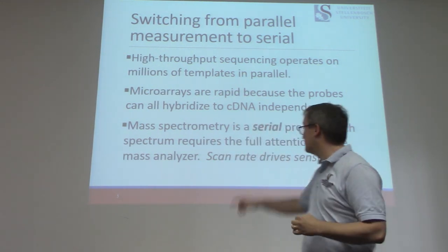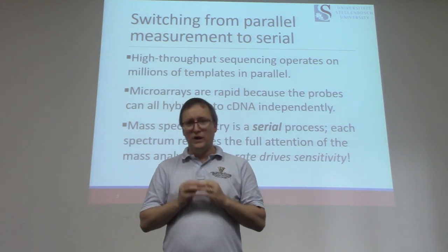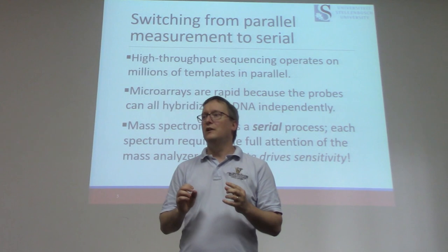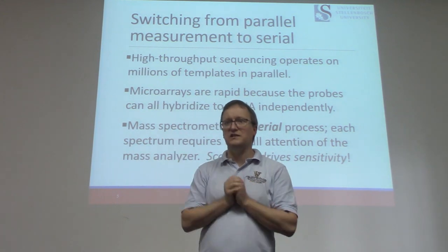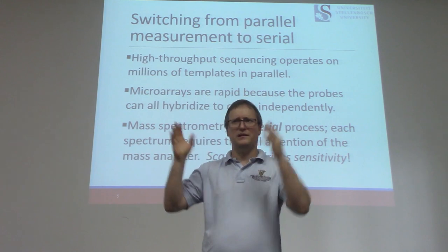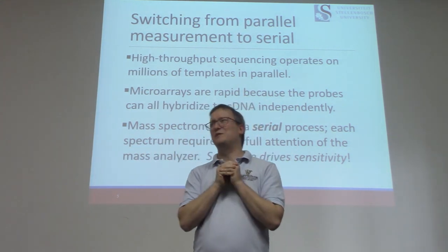One of the findings from this is this last claim, scan rate. Frequently, when one studies the history of mass spectrometry, you come away with the impression that, gosh, we can scan much more rapidly today than we could in the old days. I just worked up a data set that was produced by a collaborator on a TripleTOF 6600+ instrument up at CSIR. They all have very impressive sounding names, trust me on that one.